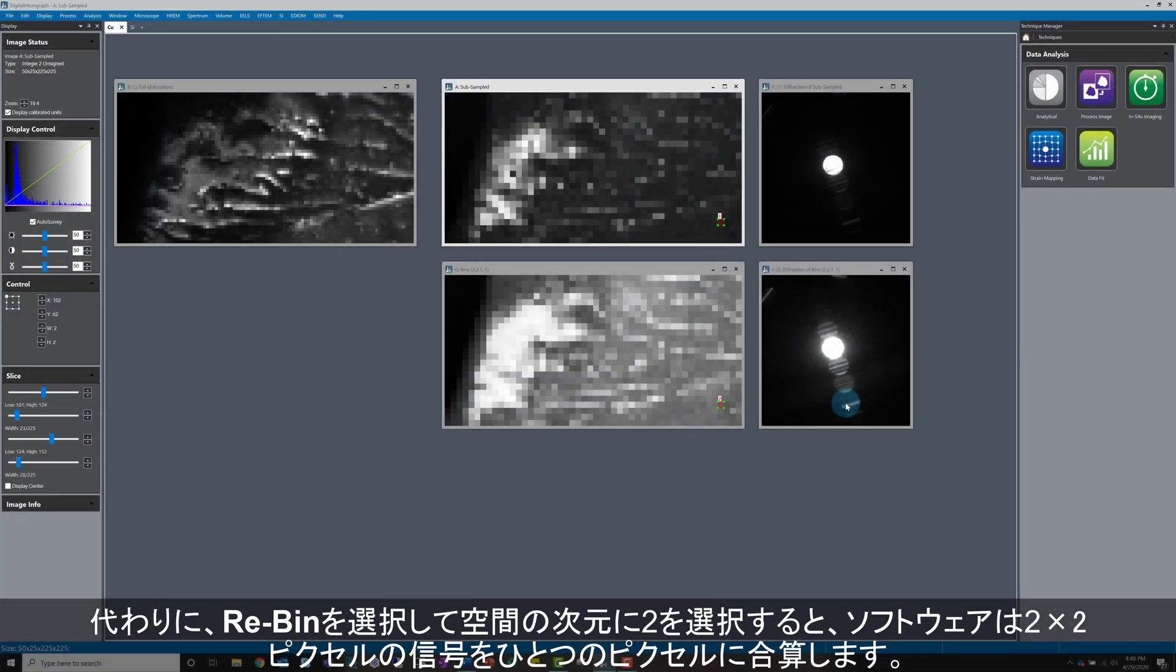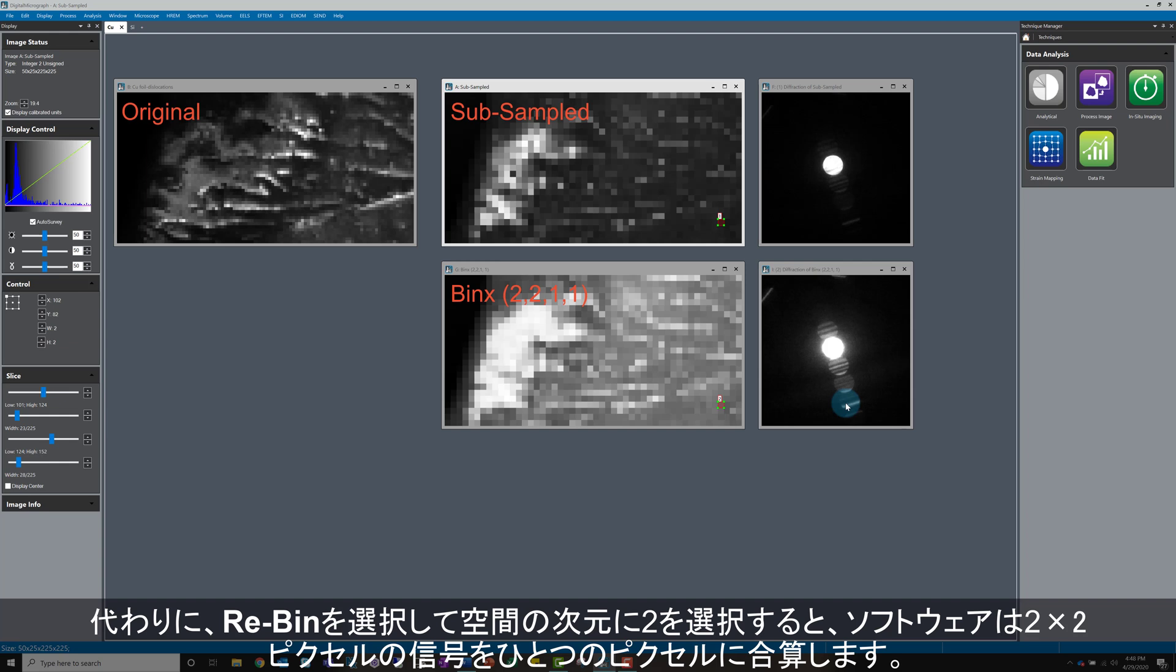Now, if I decide instead to re-bin by 2, again, only in the spatial dimension, the software will take 2x2 pixels from my scan and put them in 1 pixel in the final data object.